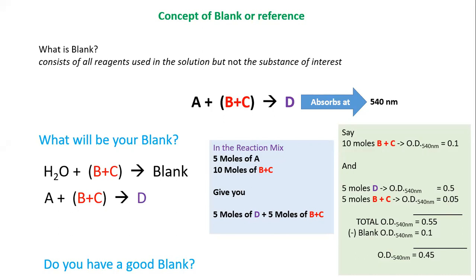Meaning, how many of you would like to prepare a separate blank for all the 5 standards that we normally prepare? I bet no one of you would like it, right? You'll prefer using a single blank, and that is what is actually done.